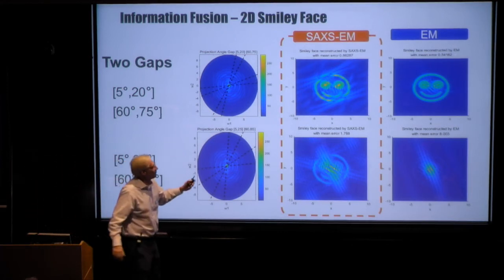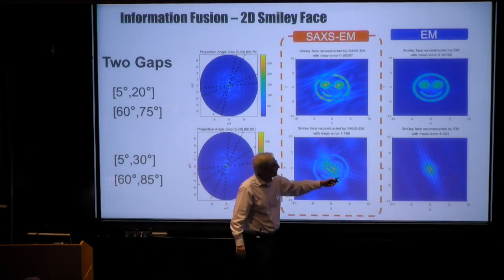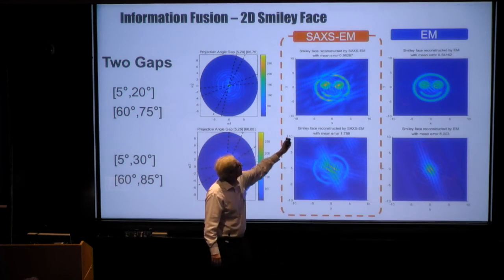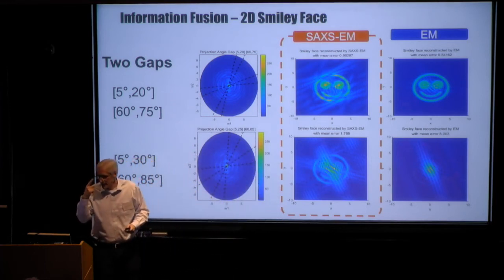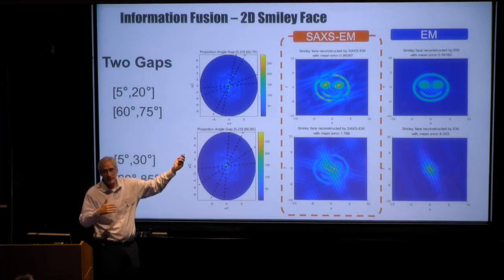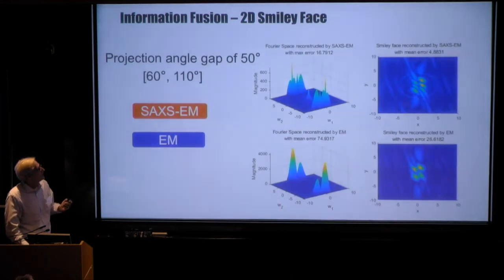And over here, there's another example. So here, both of them basically don't work. I mean, you can still see some outline of the face. Over here, in just the projections, you don't get very much. Over here, this is the fusion. Over there, that's EM by itself. Now, remember that there's an intensity. The eyes were yellow. That was a higher intensity before. So even though the EM just visually doesn't look bad, the intensities are off relative to what they should have been given the initial model.